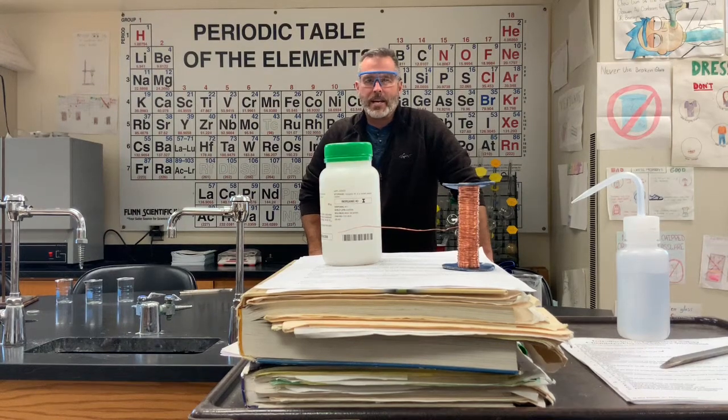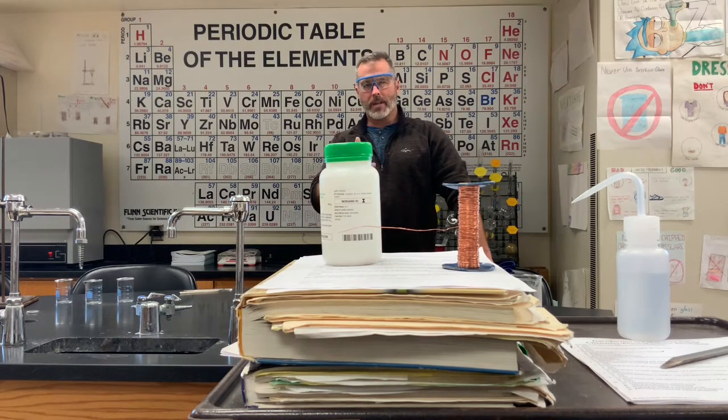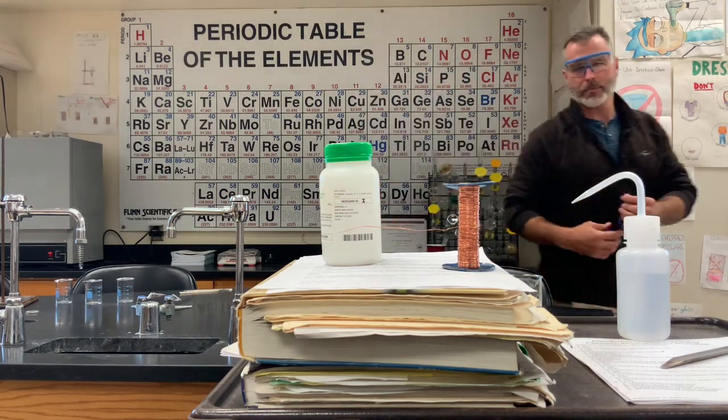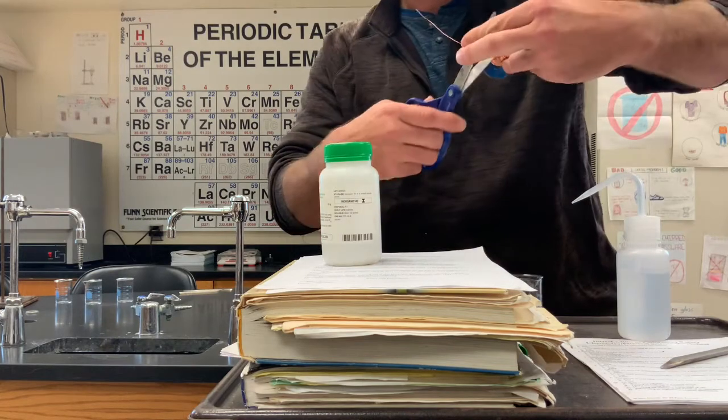Alright guys, we're going to go over some reaction types today. The first one we're going to have here is copper wire and silver nitrate. So I'm going to come up here and prepare the copper.